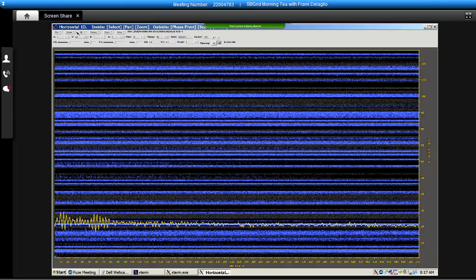And I can also use these caret buttons in the command panel to advance the slice number one at a time, or to type in a particular slice number that I'd like to see, like for example, slice number 1. Just type in the number 1 here. So here's slice number 1.